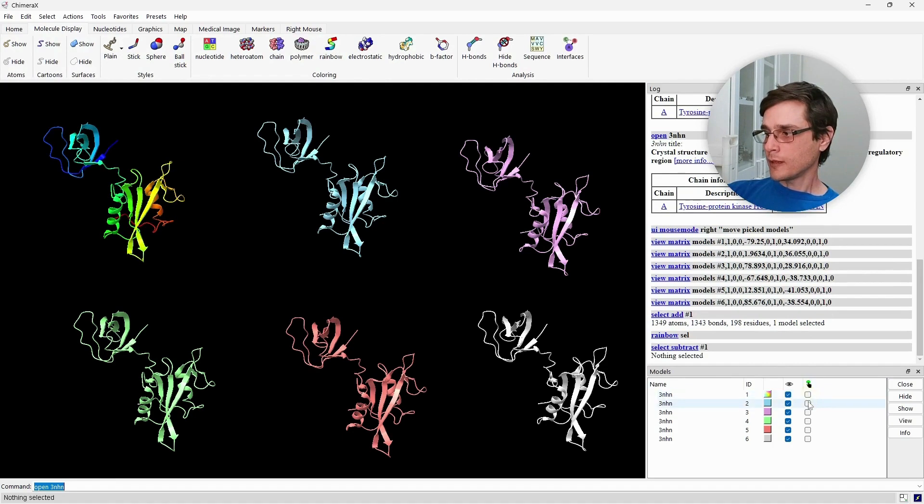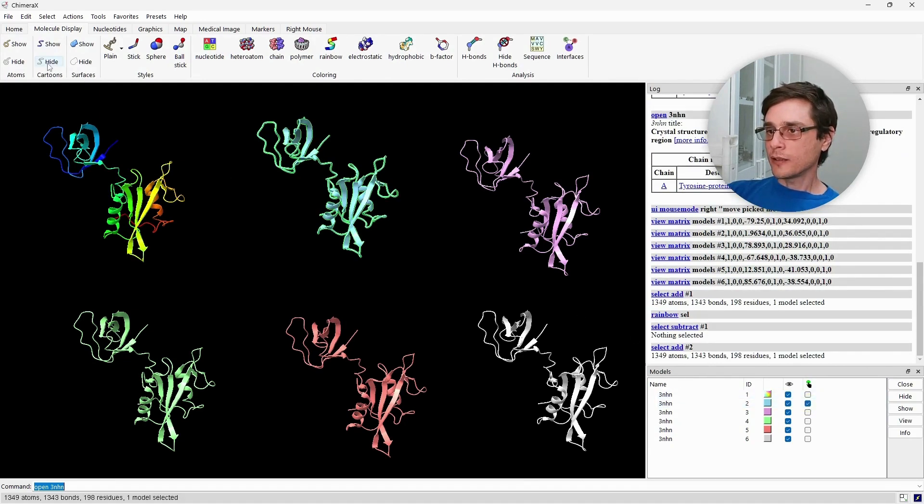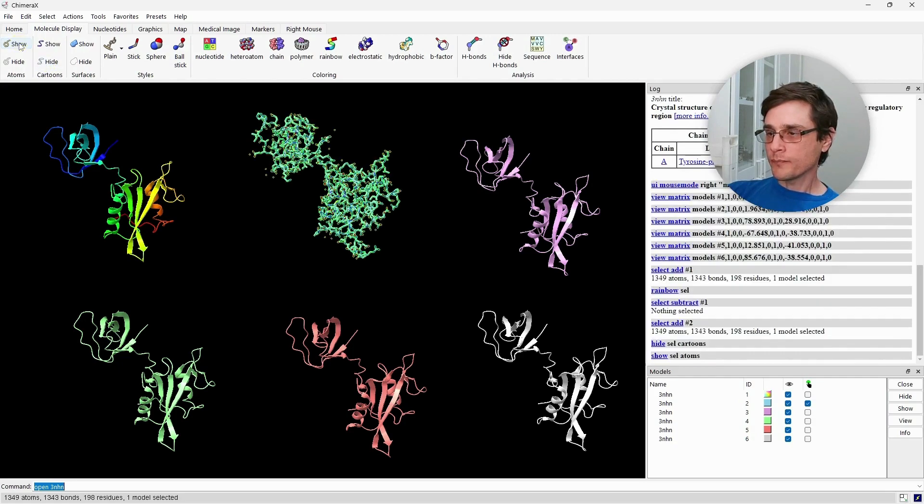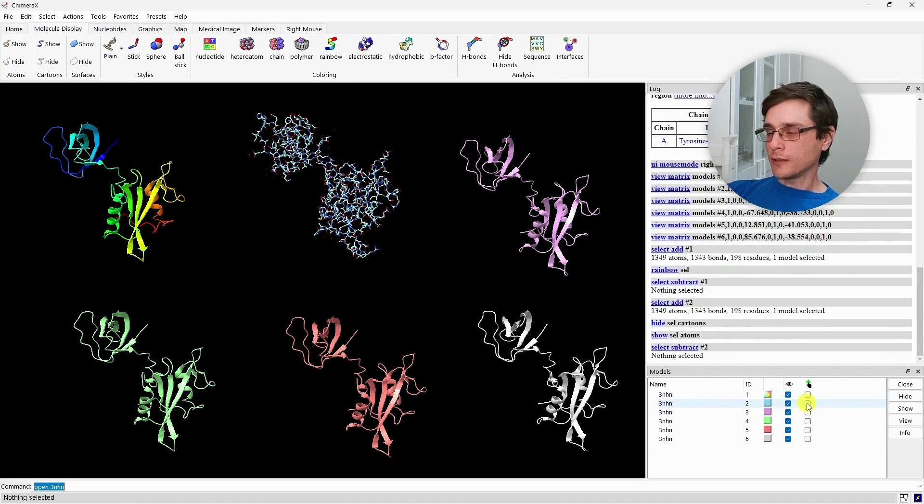Let's unselect it and select the second model. Now, let's hide the cartoon and show the atoms. And, unselect it.